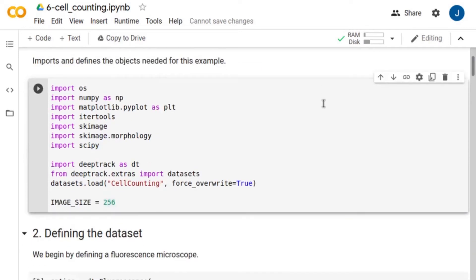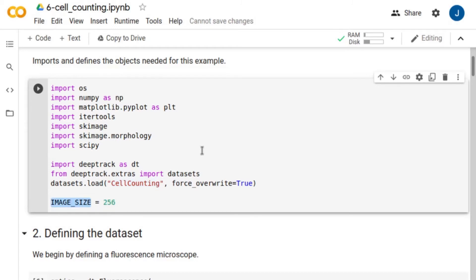First, we import the packages needed for this example, and we load the database we will analyze later with DeepTrack. Additionally, we specify the size of the images the network will be trained for.